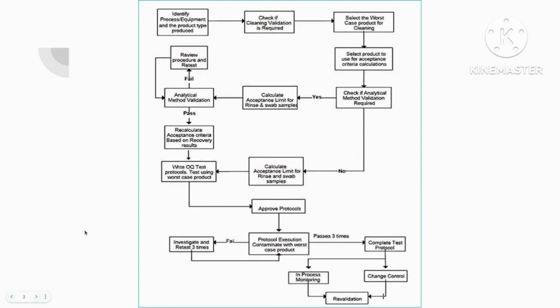Reduced testing may include reducing the number of tests and reducing the sample locations to a few key critical areas known to be critical sites or hotspots. For change to current cleaning process and procedures, the extent of retesting may be reduced to a single test. This shall be stated and approved as part of the change request process.